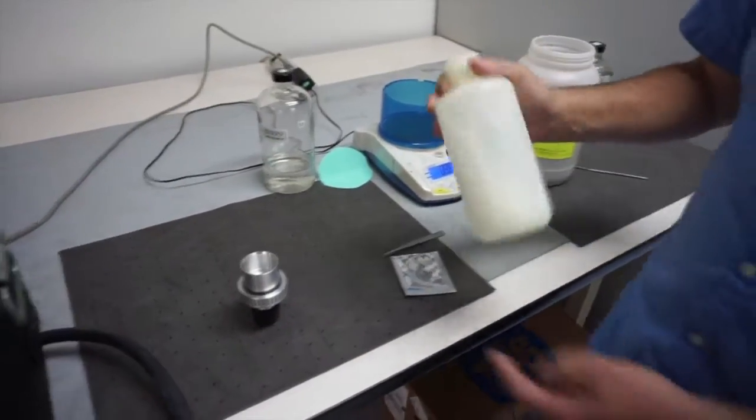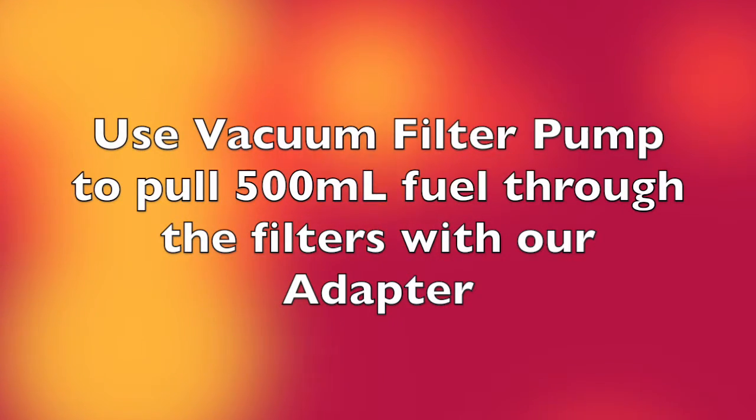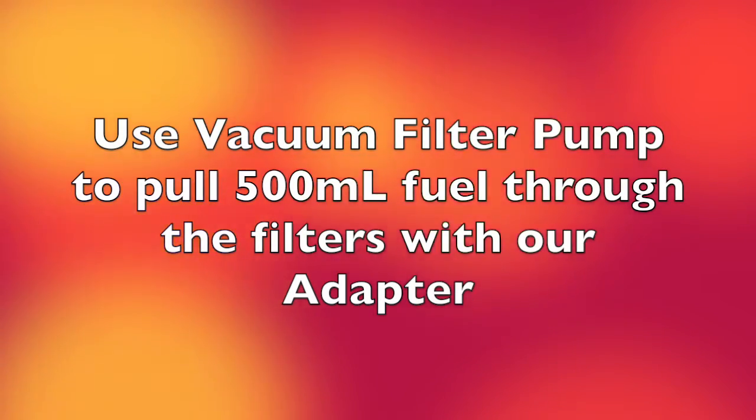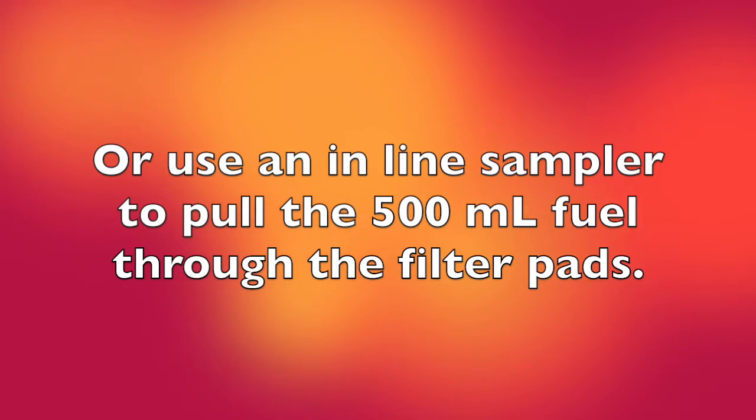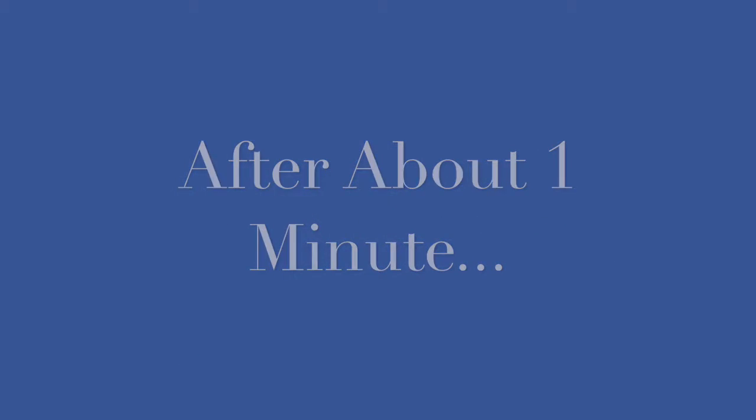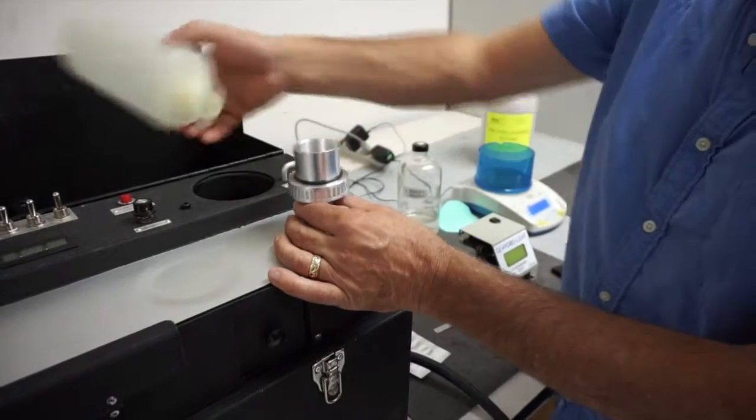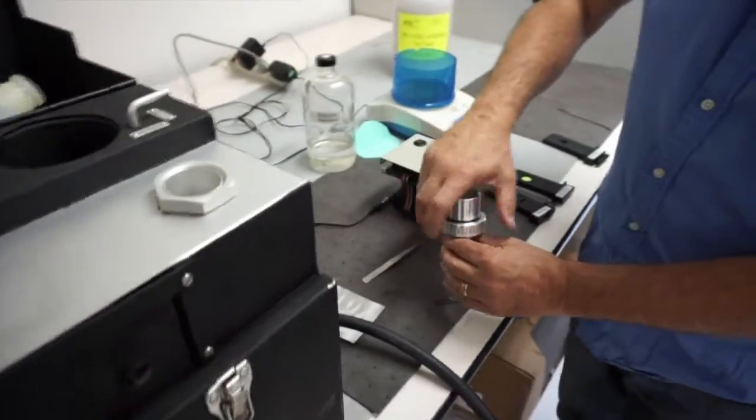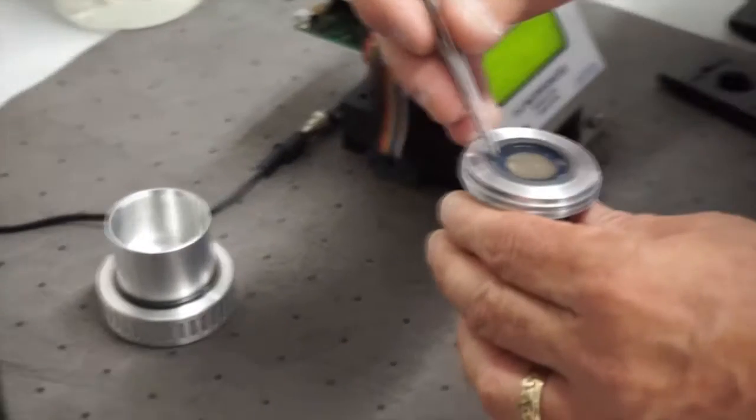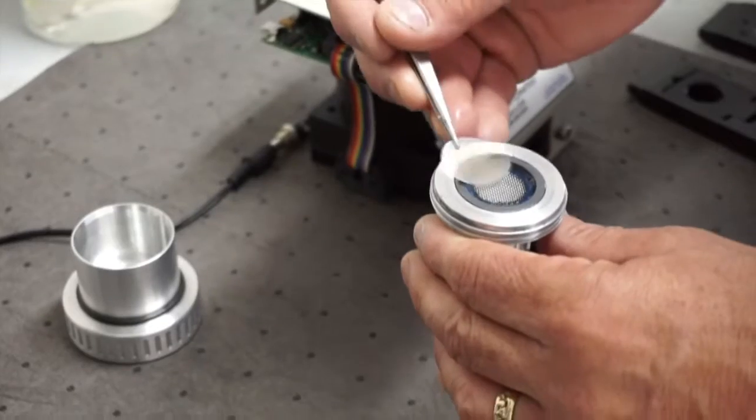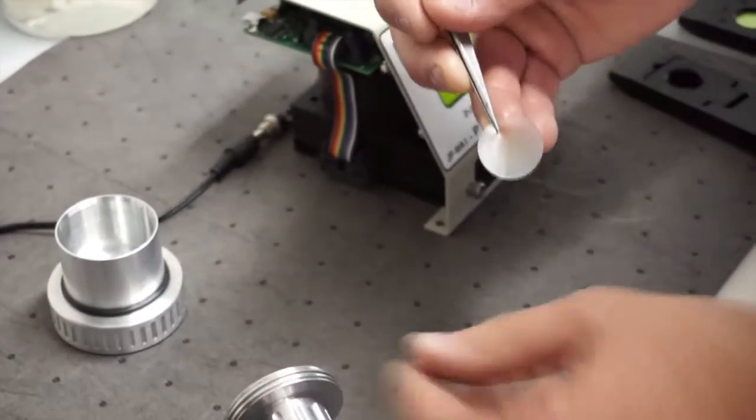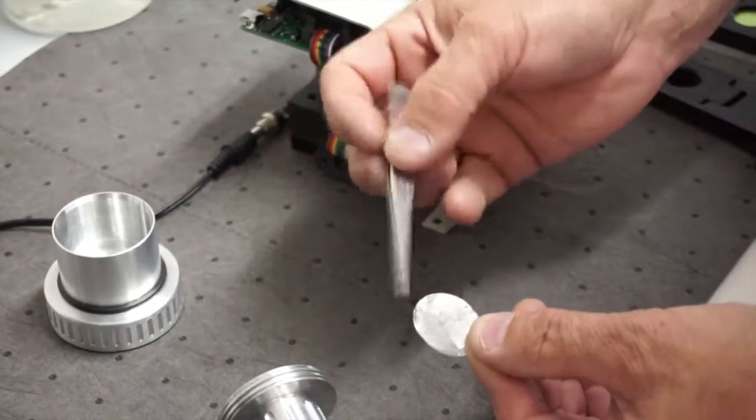To pull the fuel through the filters, once the fuel is sampled through the filters, you take the holder off, take it apart, and you take the two filters. It's two filters so it's two measurements. So here I have now both of them. So you can see they're separated.